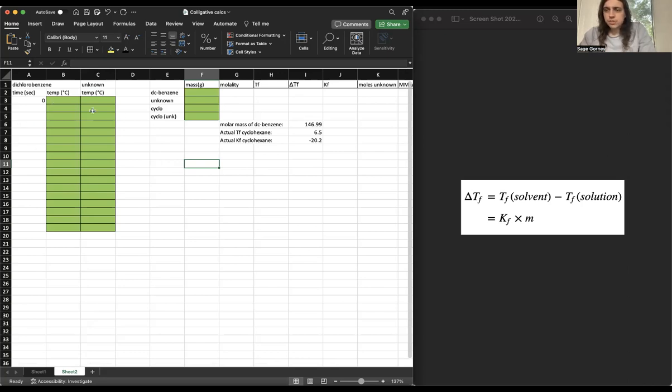First, pause this video and make this kind of template for yourself. Here I have time and I have temperature. Just start with that. It'll be fine. So at time 0, let's say we started at 20 degrees Celsius. Now, a quick tip to fill out the rest of this time chart, you can do equals. That's how we start a formula in Excel. And you can click on the space above it and add 20 because we're taking measurements every 20 seconds. And then just click on the cell, drag at the bottom right, and boom, that's all filled out.